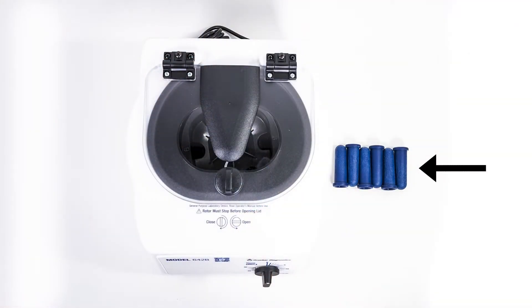Let's start by making sure we have all our necessary accessories. These came out of the accessory bag packed in with your centrifuge. You'll need your tube holders and your centrifuge with its attached power cord. If you're missing anything, please contact Drucker Diagnostics.